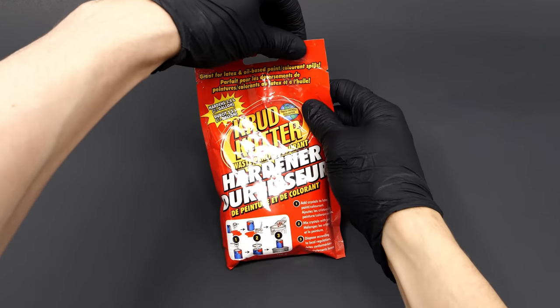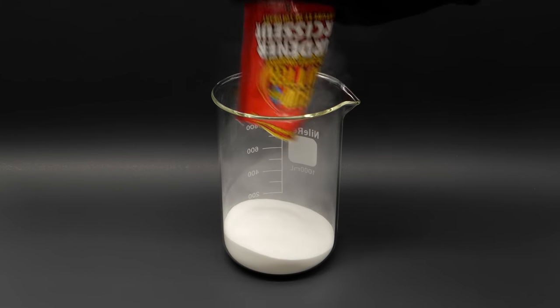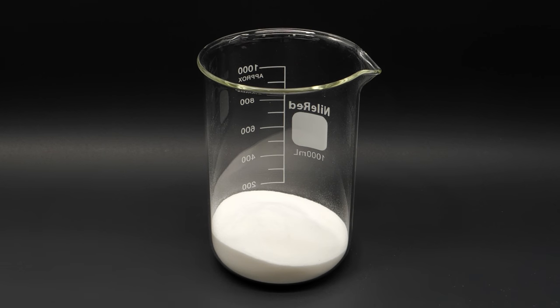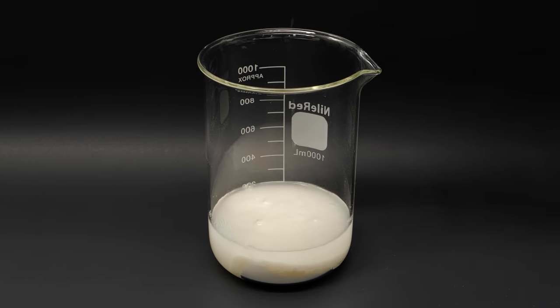I'm also gonna need some crud cutter, which is made of something called sodium polyacrylate. With all this in the beaker, I now need to add 125 mls of the alcohol.